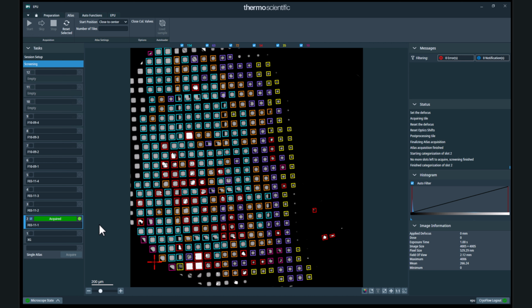Within the same atlas, EPU is accurate enough regarding classifying thinner squares with one color and thicker squares with another color. However, these colors can't be used as gold standard classification among different atlases, as they might have substantially different ice thickness, making the characterization of these two atlases completely different.